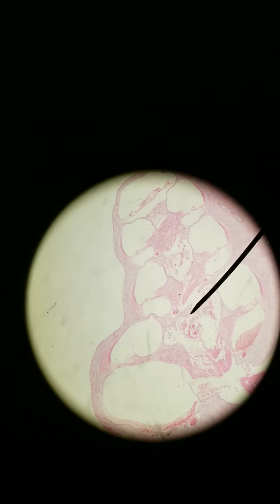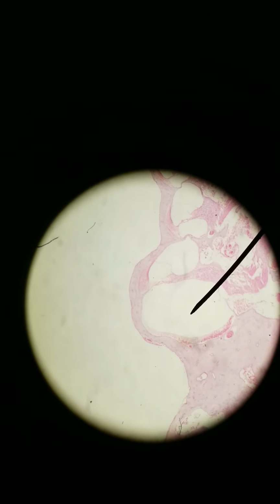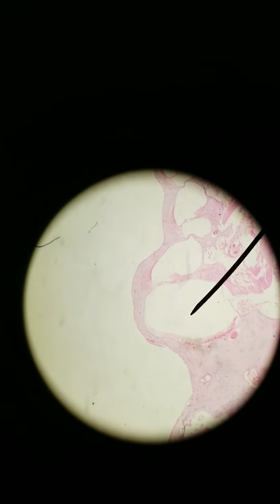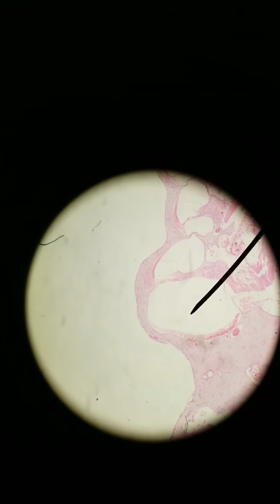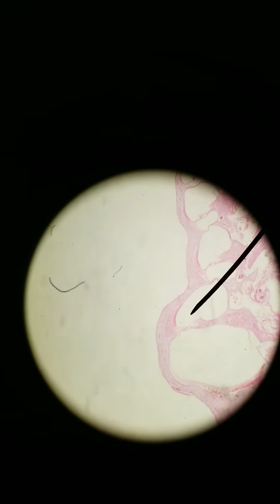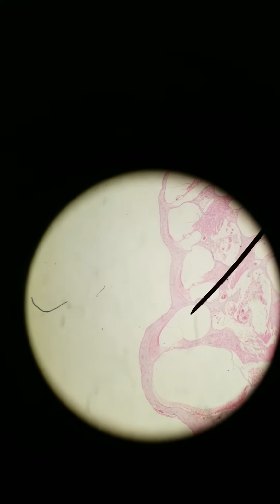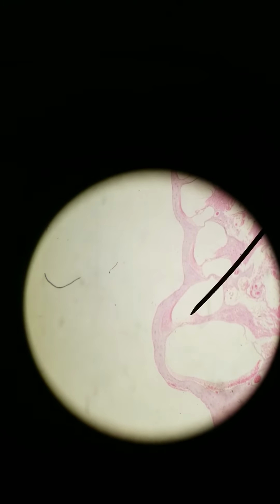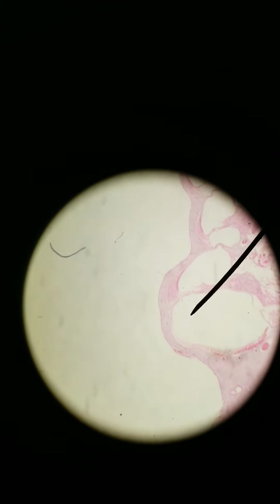Because we've made this cut through it, we're seeing the inside. So we see these ducts spiraling around and around. The larger of the ducts on the bottom is called scala tympani, the tympanic duct. Scala means duct. The one in the middle is scala media. The one on top is scala vestibuli. Sorry about the focusing, let me try to get it right here. It goes vestibuli, media, tympani.